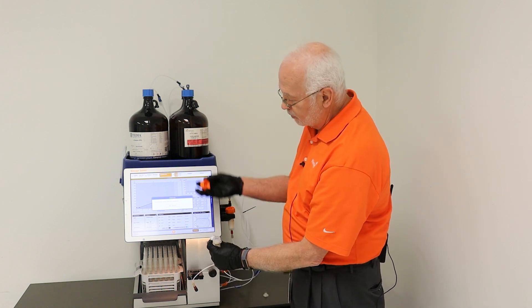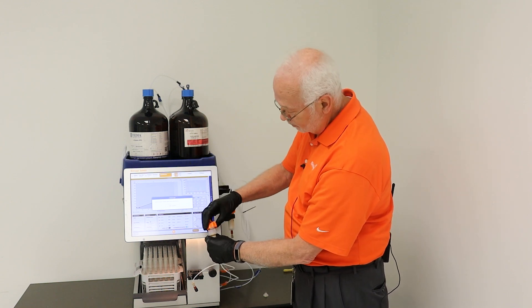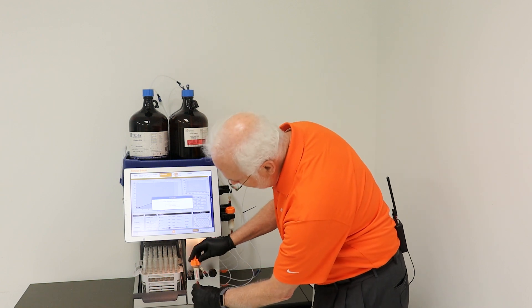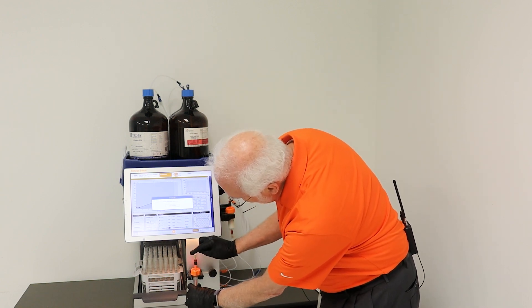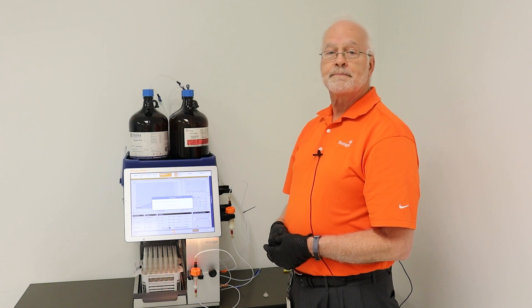Now you have the ability to put the samplet actually in the cap and it'll hold in place. Then you can attach this to the top of your column, put the column back onto the system, and attach the inlet tubing. Now you're ready to start your run. Thanks.